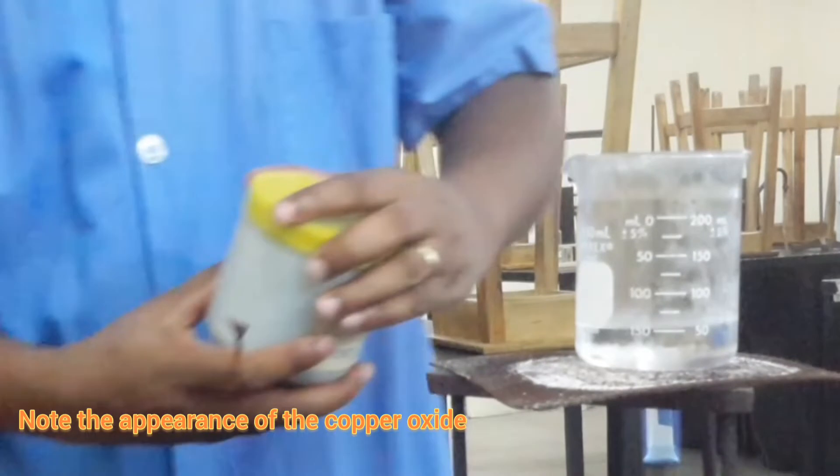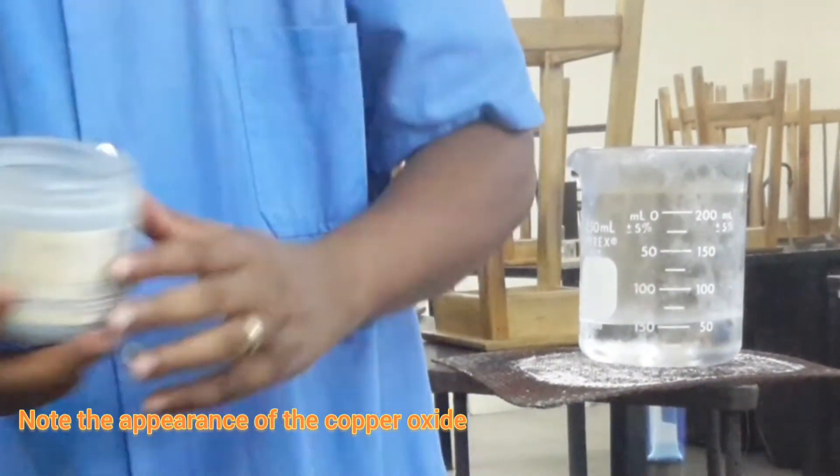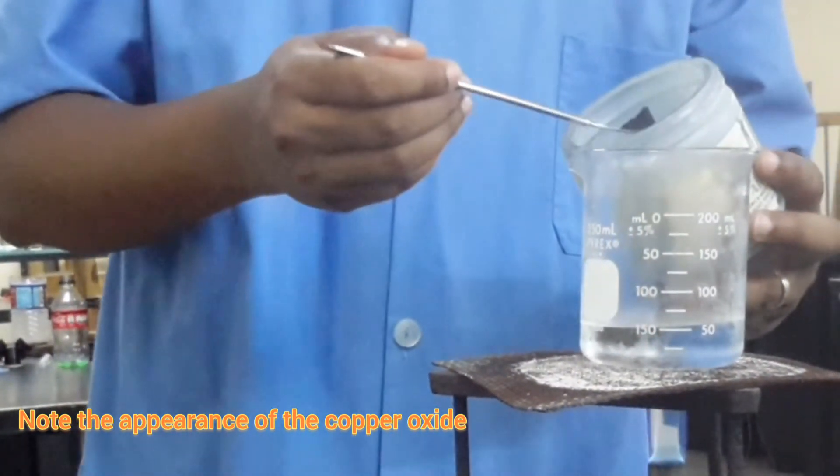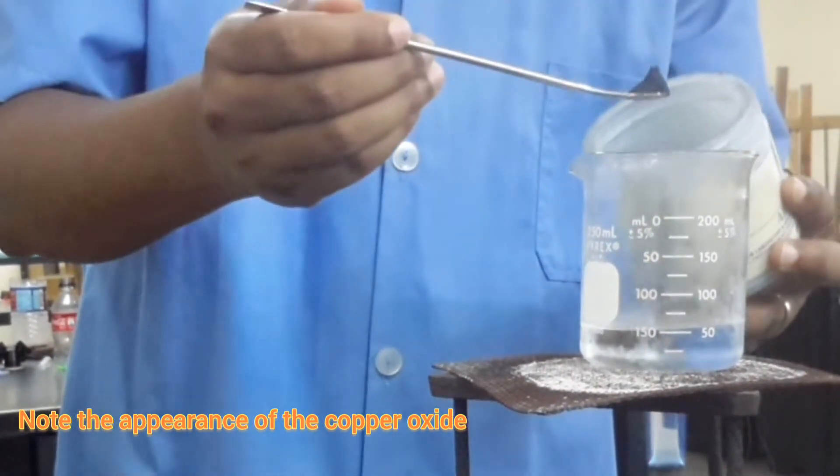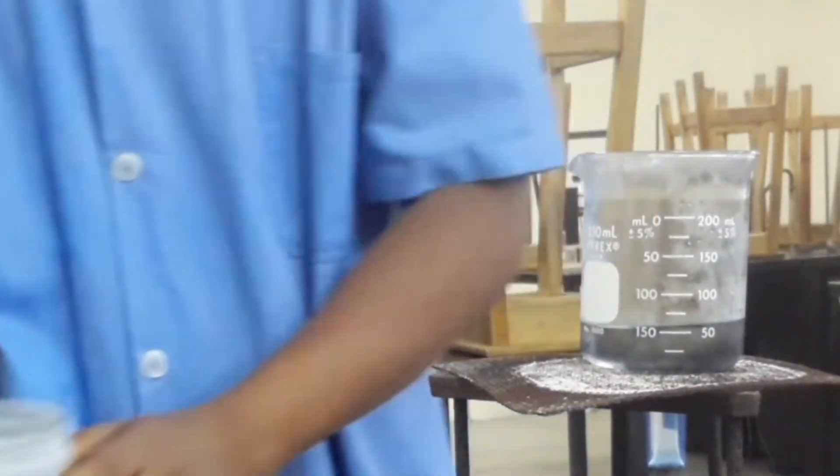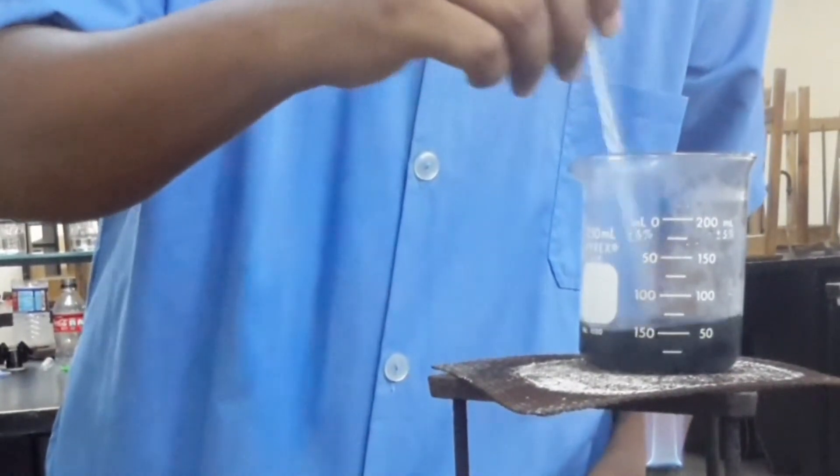We're going to be adding copper oxide to the acid in excess. We're going to do it spatula load by spatula load. One, then two, and we'll just stir as we go along.